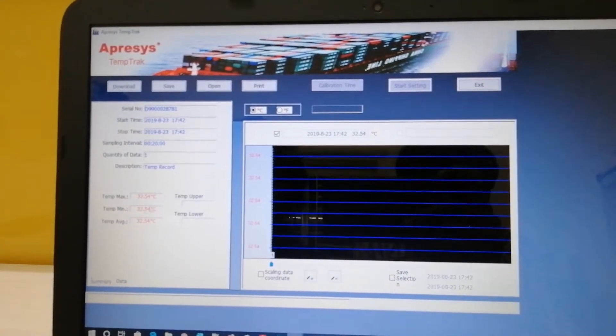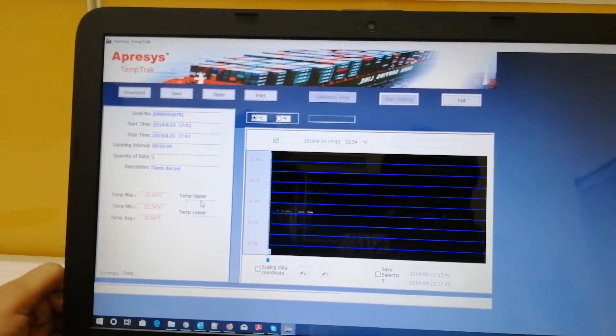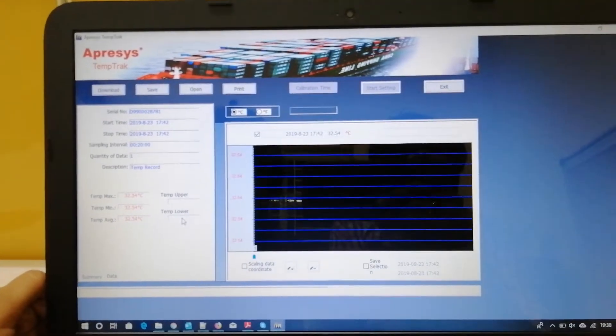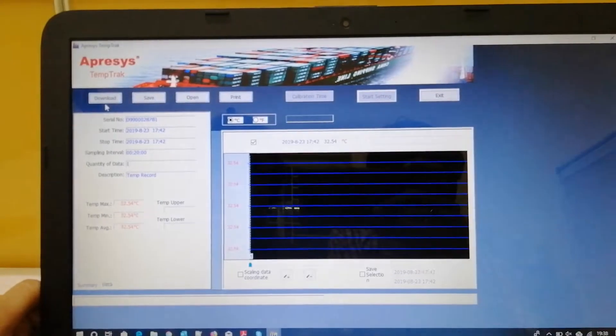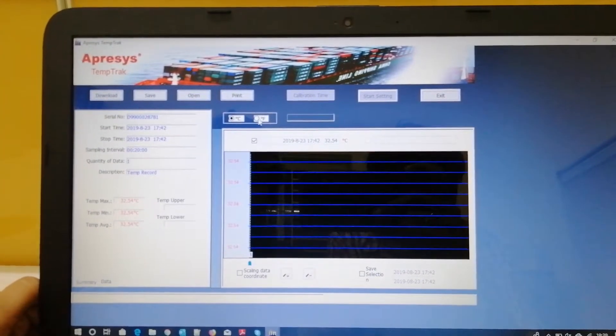This shows the temperature: maximum, minimum, and average. You can set alarm limits for upper and lower temperature. You can download and save the data, and directly print from the software.